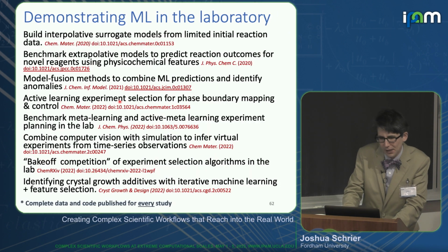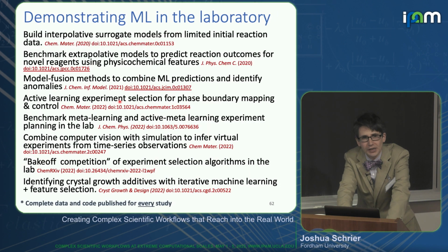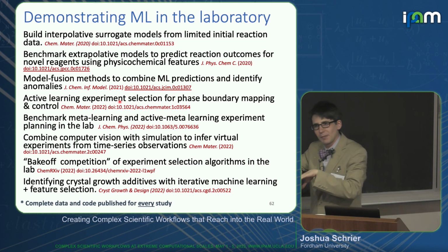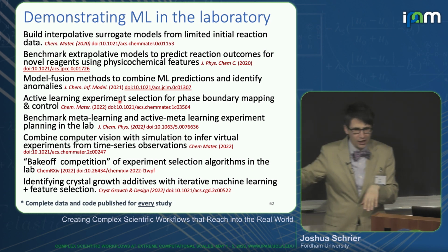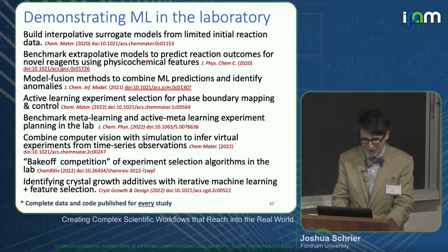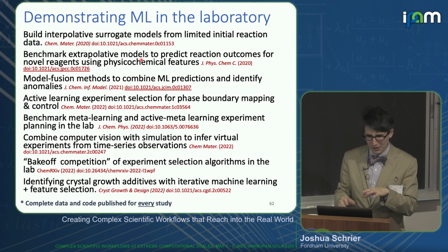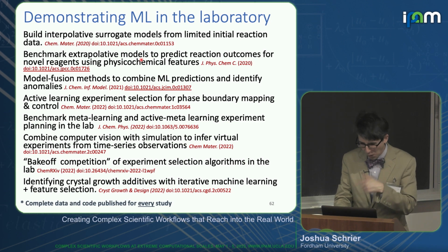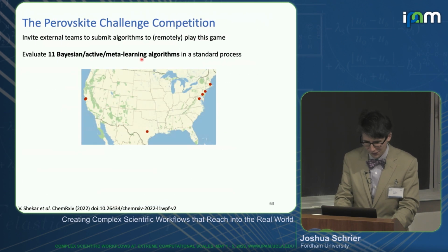The other thing you could do with a platform like this is use it to test your machine learning algorithms, because now we've separated developing the machine learning algorithm, and even who is developing it, from the people performing the experiments in the lab. So we've looked at lots of different test cases, comparing different things and trying different techniques. I just want to tell you about one that we ran a year ago that was really fun. And it exemplifies things that you can do if you have this type of experimental workflow software.